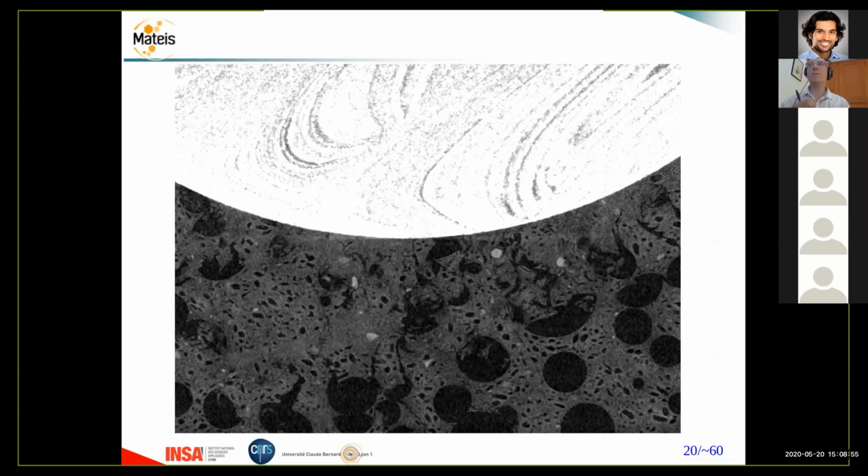If you have very high spatial resolution, you will have a very low temporal resolution, and this will not be enough for stick-slip. Okay, thank you. People are doing a lot of improvement on the temporal resolution, but for the standard procedures that we have today, I think it's still not enough.